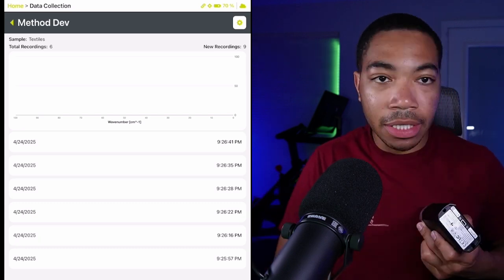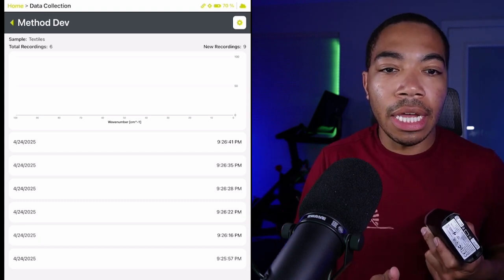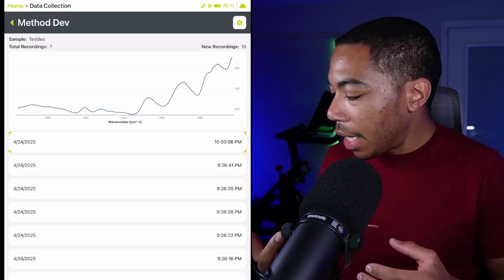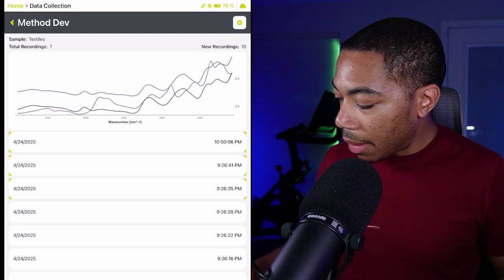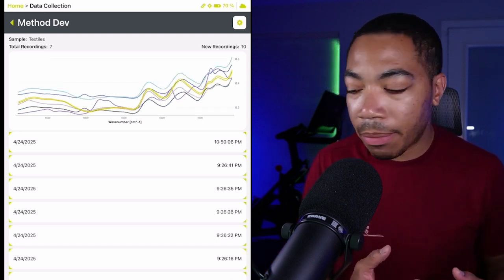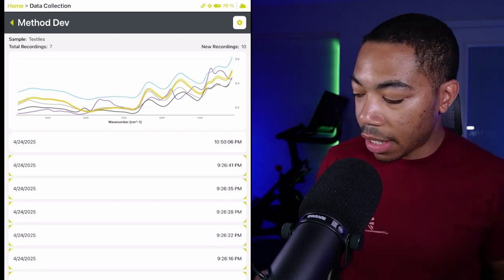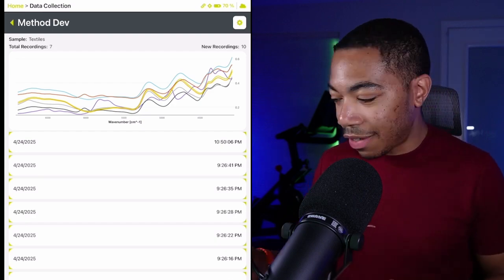All you have to do is just touch some point of the material, and you will see that new scan appear on the screen. Now, here is one spectrum that I just collected on this shirt. I'm not going to keep it, but I will show you what the other data look like in this context in the samples. And so now I am toggling the sample I just collected, and I will now remove that and show you what these 6 different shirts look like.